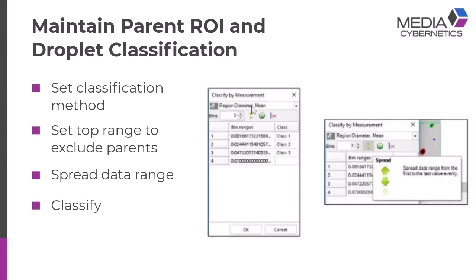Standard, we get the image, and this is what we end up with here on the left. Then, once we've done that, we can select our classification method, our classify by measurement, the single variable class. It's the classify group on the count size tab. And then, I choose which parameter I want to measure. One of the key things is because when we count by ROIs, those regions have been changed into measured objects to make them parent objects.